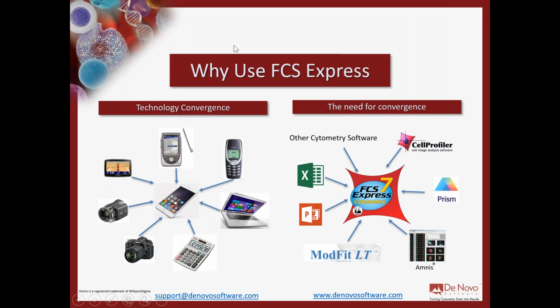And where I'd like to kind of start with this is, why use FCS Express? I know a lot of folks out there are already using the software, but if you're not, why would you even want to bother? And especially for working with high dimensional data sets. I don't know if there's anybody out there like me. I used to actually own this Nokia phone. It was actually the first cell phone that I had, but it really did one thing. It made phone calls. You could also send a $1 text message if you wanted to. Maybe it did three things. You could play a game of Snake, right?